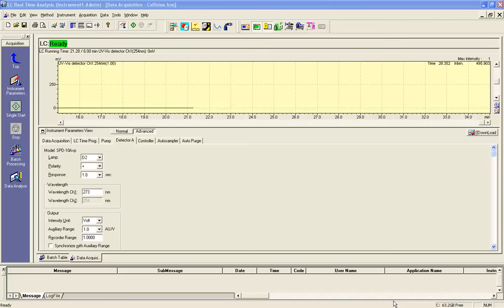Okay, so we are going to pick up from where we left off previously, and this is the Detector tab, which is right up here at the very top. And the detector that we have on our HPLC, this one at least, is a UV-Vis detector. So the UV-Vis detector is the eyeballs of the instrument, and we have to make some settings here. We have to let the instrument know what to see and what not to see. So we have to tell it to kind of fine-tooth and become very specific on what I'm looking for.